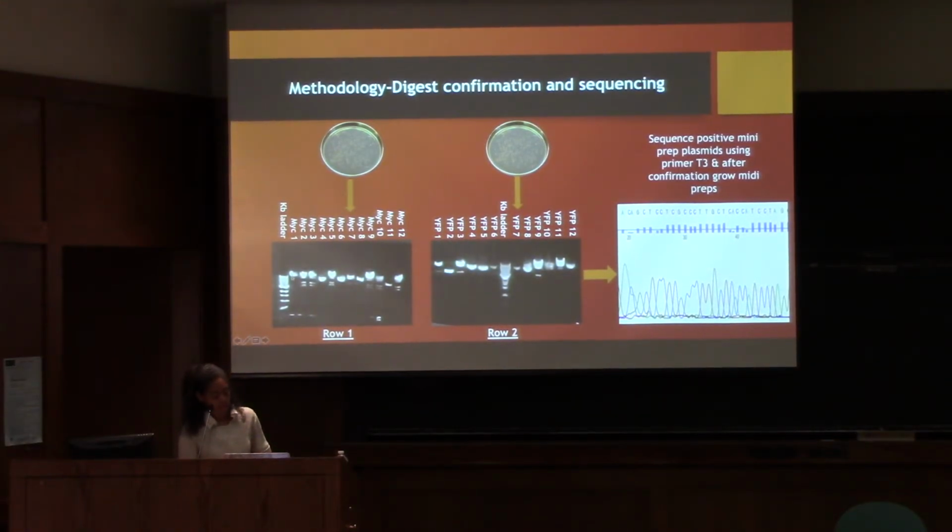So there's about 24 confirmations that we use just to make sure. So the first 12 is the MYC protein that we use to tag it, and the double bands we sent to sequencing, but then we had to retest the single bands because that means it wasn't expressed properly. And along with the YFP, we sent the double bands to sequencing.